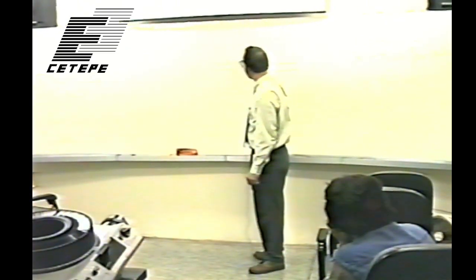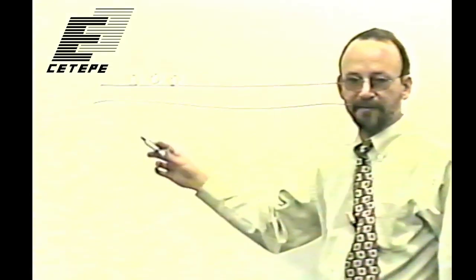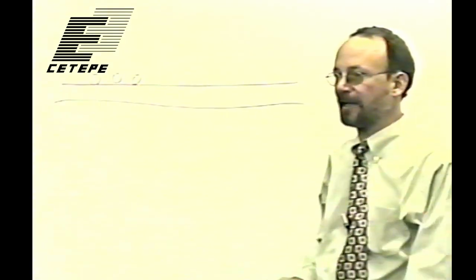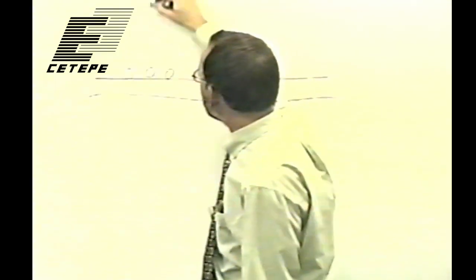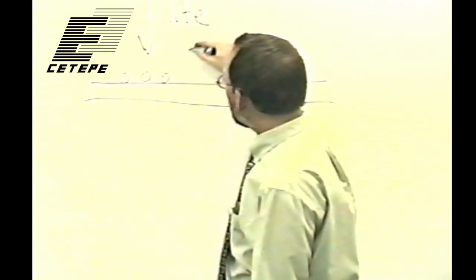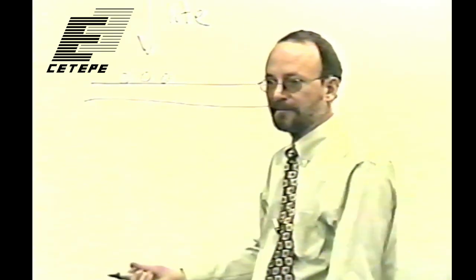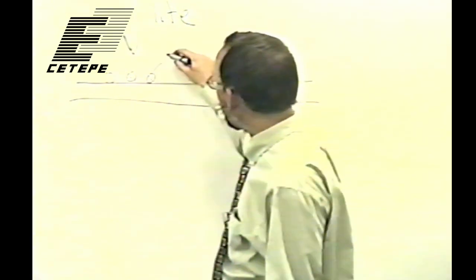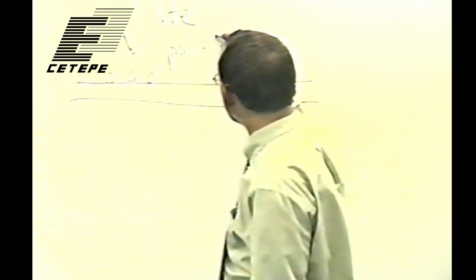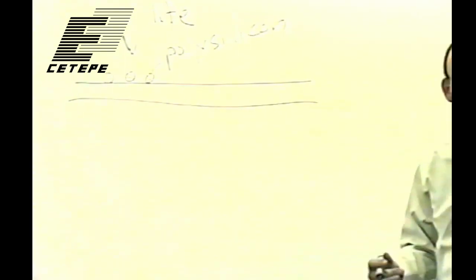But I mentioned that we have these gates or electrodes. And in most inexpensive devices, and even in the kind of $50,000 cameras that I'm talking about, these gates are on the photoactive side. So your light is coming in this way, and so these gates cannot be metal. They have to be a conductor, but you want them to be translucent, so they don't block all the light. So these are usually made out of polysilicon, which is a conductor that is partially translucent. It's not completely clear, but it lets the light through.